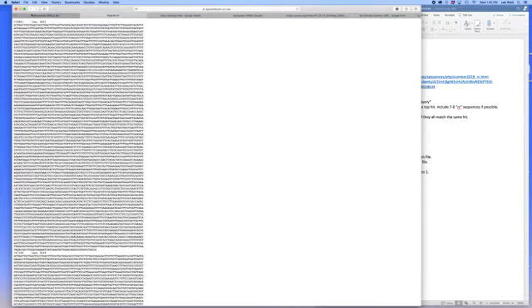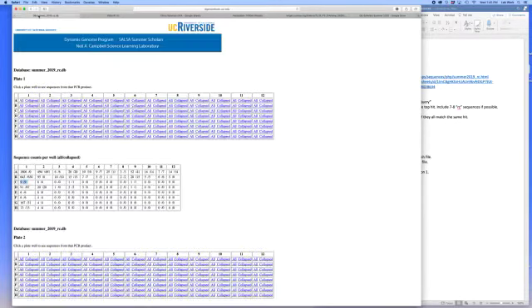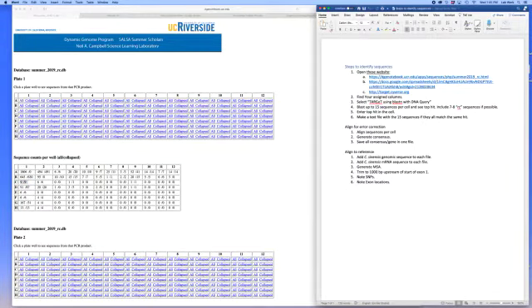We will meet on Friday and talk about progress. It'd be great if we're done by Friday. It really won't take you long. Put on a movie and analyze sequences. Okay, and then Friday I'll have more instructions, if not before, on what to do for the next 2 steps.